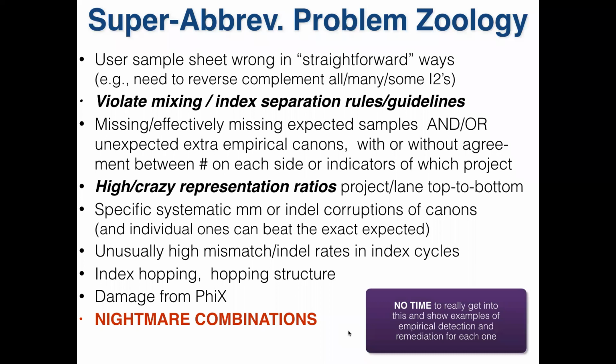Including this one. But then there's a super bright guy that's near the top of the histogram, and then if you look them up, it's the standard sequence or something off. And so clearly, somebody made a mistake and used the wrong index, with the level wrong or something.